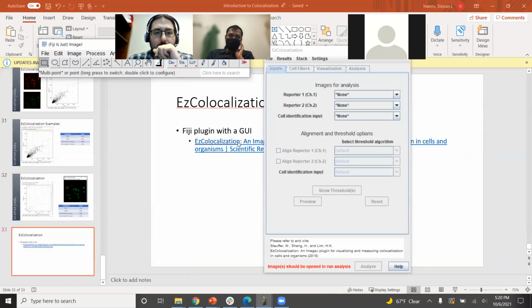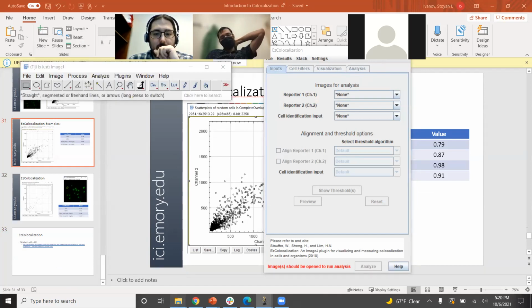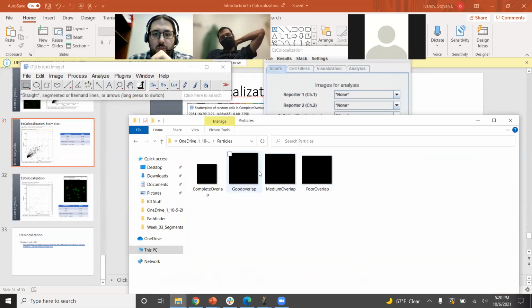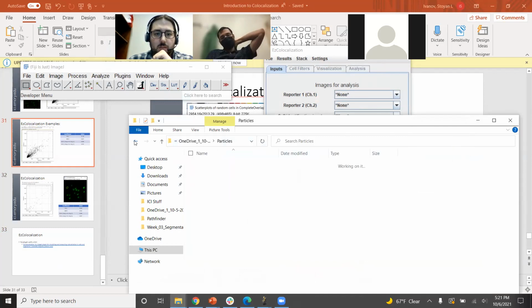Gaurav did something that I want to go over as well, which was he created a region of interest using the ROI manager. And one of the examples he had. So open. Actually, let's go to mitochondria.